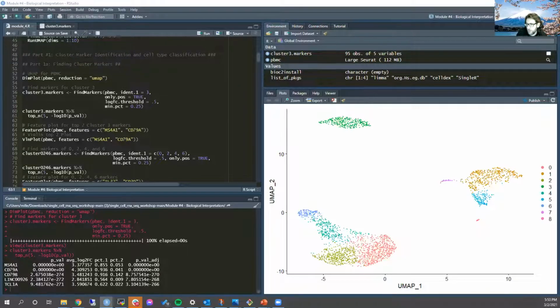Okay, so anyone not Wes, can you tell me what is the likeliest cell type identified here? What do you think cluster 3 might be? Just take a guess. And you can put it in the chat if you want. Okay, so I see NK, I see B. Okay, anyone else want to chime in? Okay, I see another B. All right, so it is B. It is B cells. Yeah, more Bs. All right, so B cells.